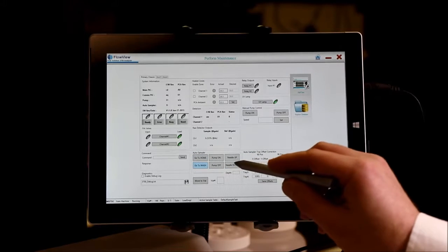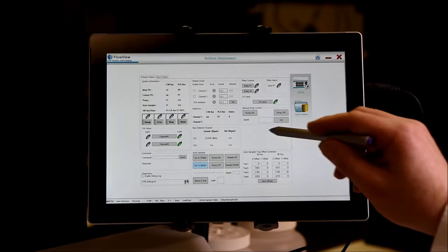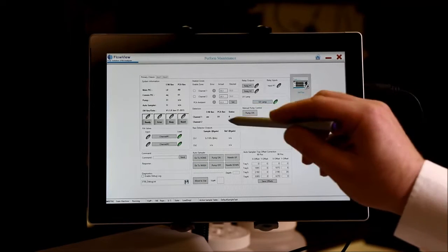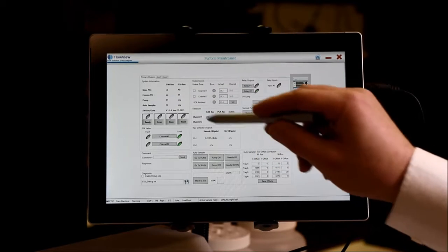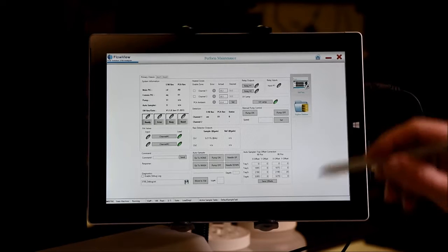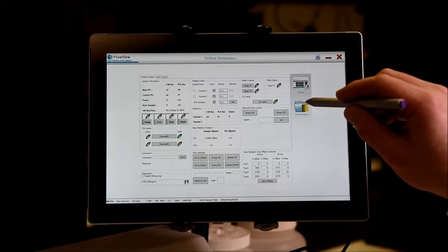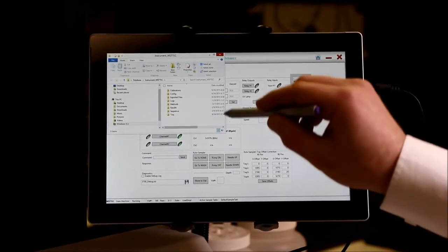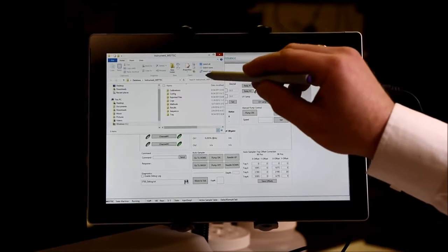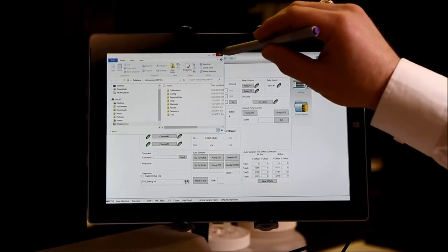You may manually control the autosampler utilizing commands here, manually take control of the pump, turn on or off the UV lamp, as well as see the firmware codes and any errors that are produced by the software. Lastly, as an easy way to access any of the data stored by FlowView, you can click the Explorer database and it will go immediately into the directory where all of the methods, results, and sequences are stored.